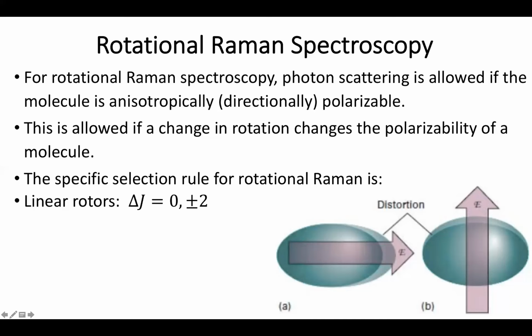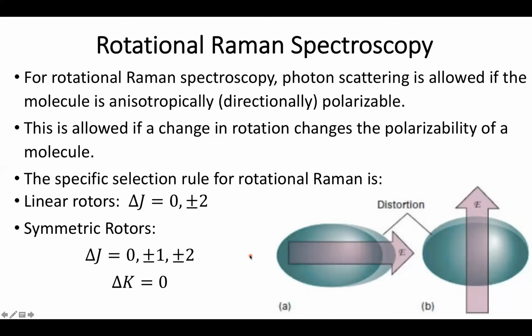However, we can actually perform Raman spectroscopy on symmetric molecules. Again, it's worth noting that the more symmetric axis, the parallel axis, the one that tends to be the most symmetrical around the middle, actually can't change states. But instead, we can see excitation or depression in the rotational states of the other directions.